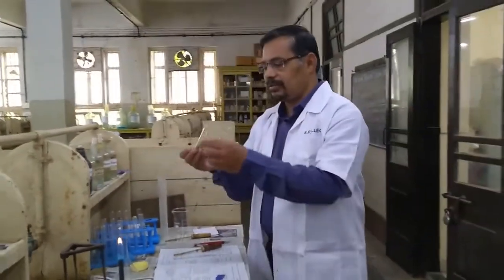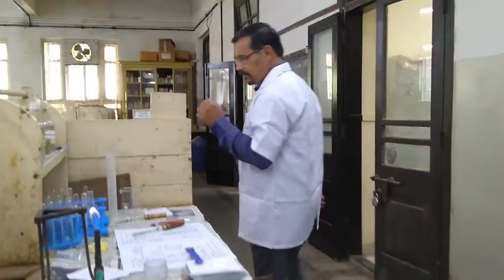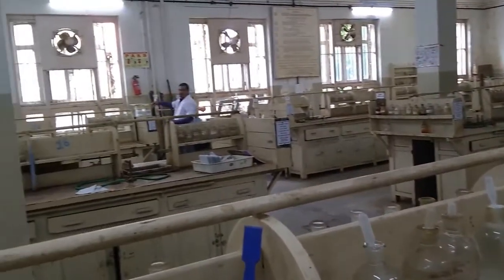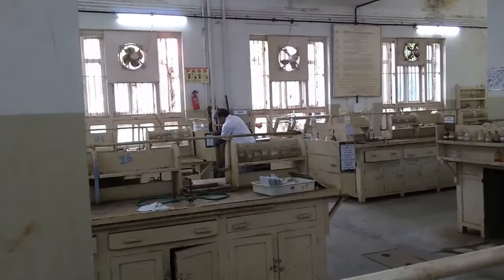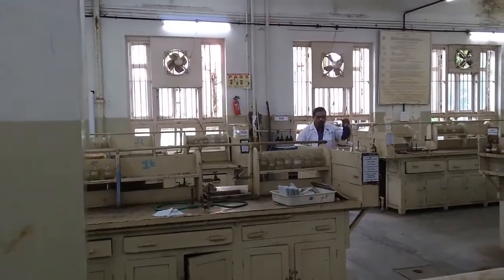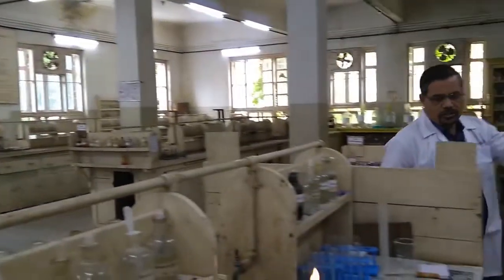Now I will take one clean test tube. Then I will prepare a mixture of this mixture and distilled water. So I will add distilled water. So I had added a small quantity of distilled water to the given mixture.